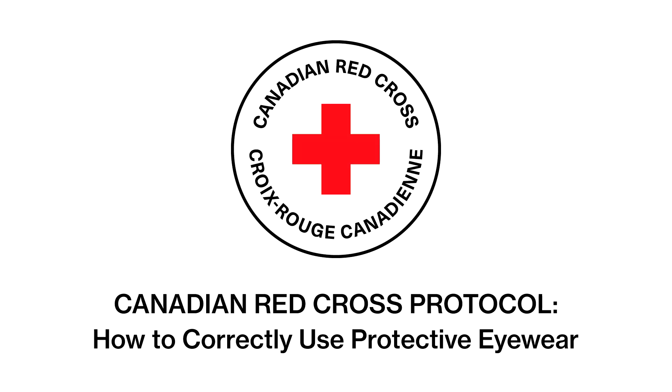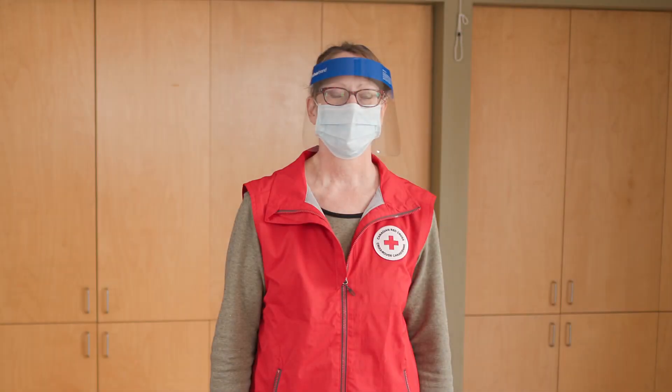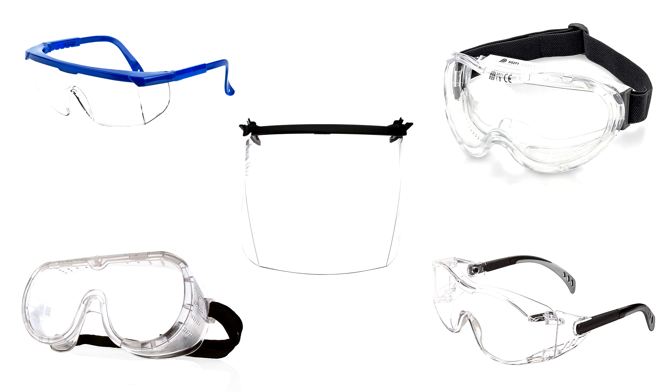The Canadian Red Cross Protocol for how to correctly use protective eyewear. Eye protection protects the eyes from exposure and injury. There are many types of protective eyewear, such as safety goggles, safety glasses, and different types of face shields.